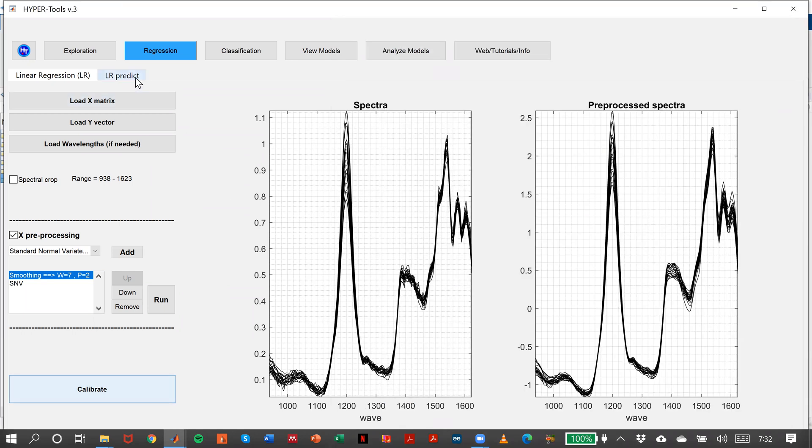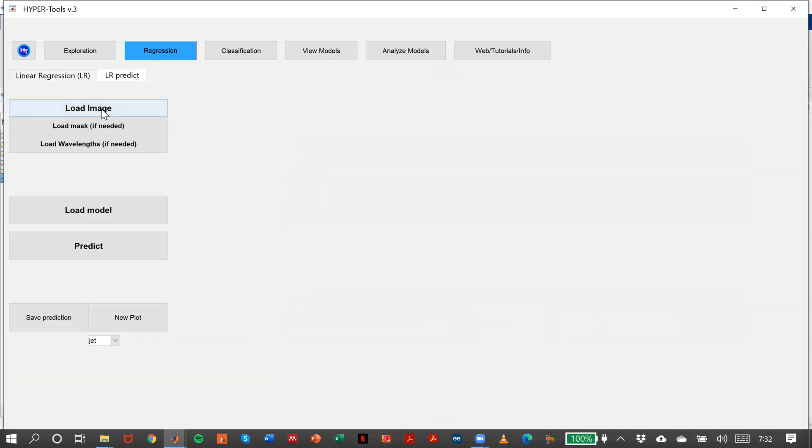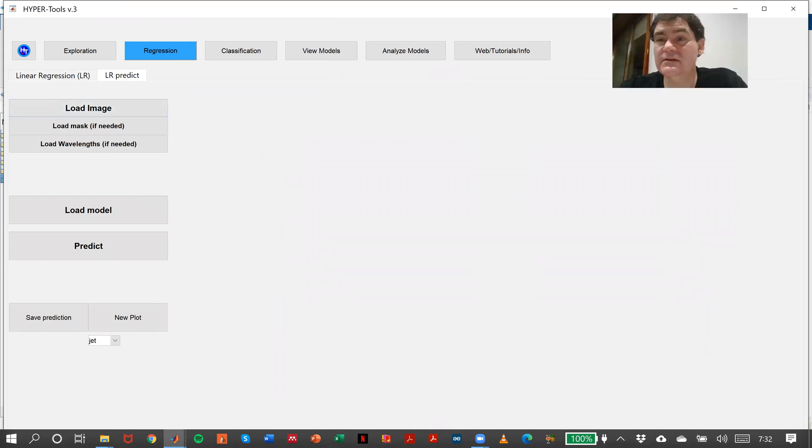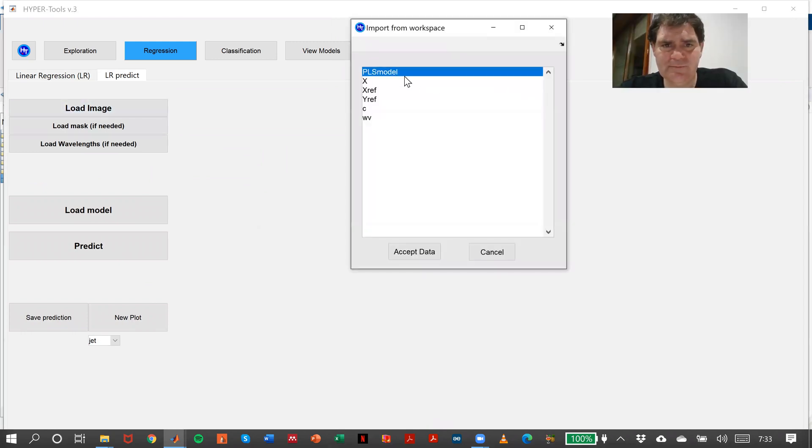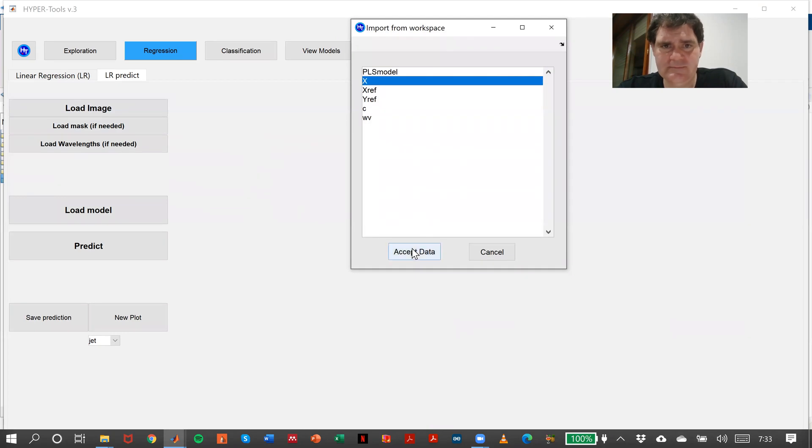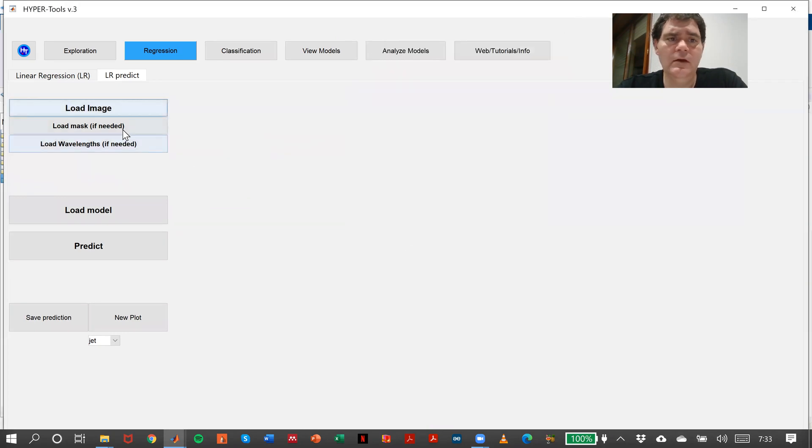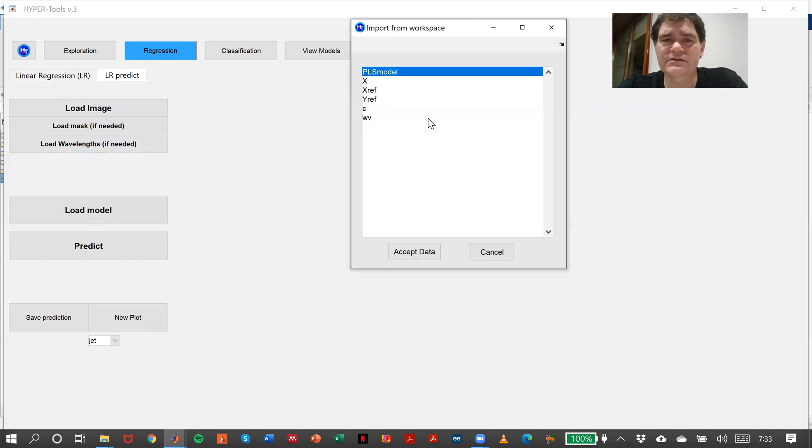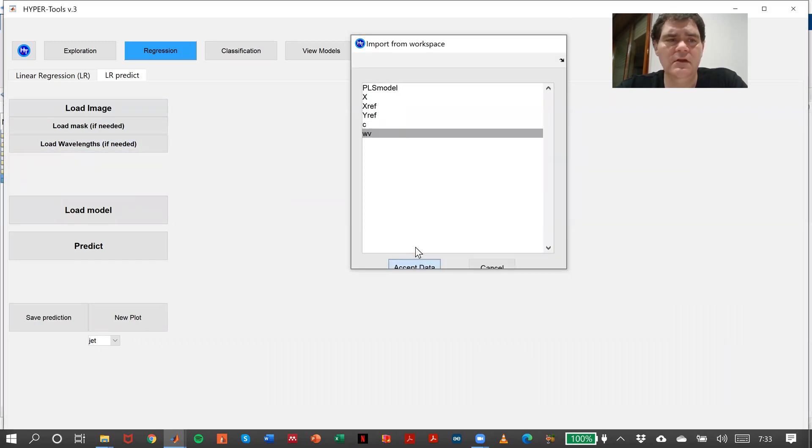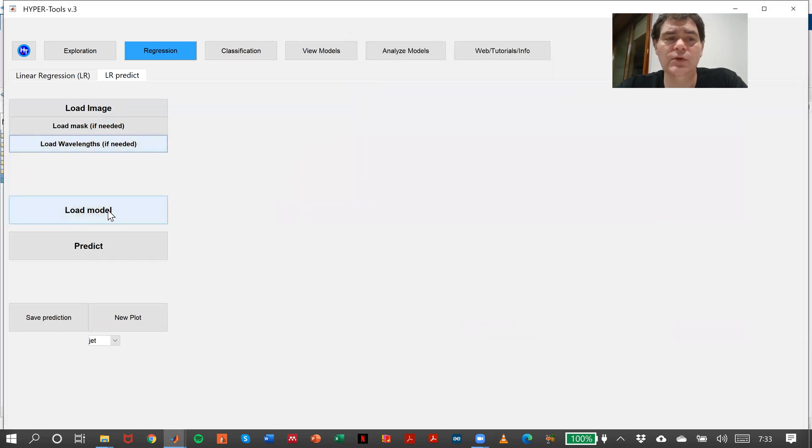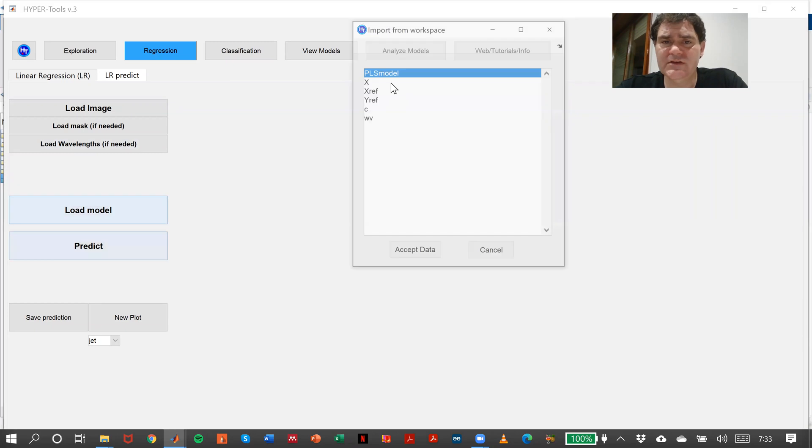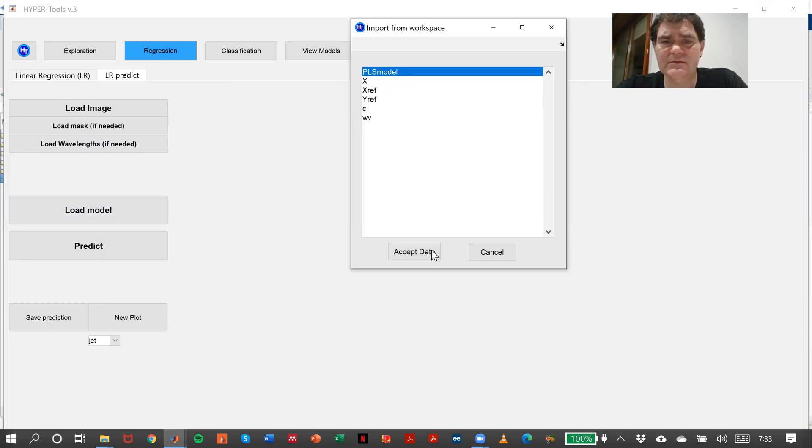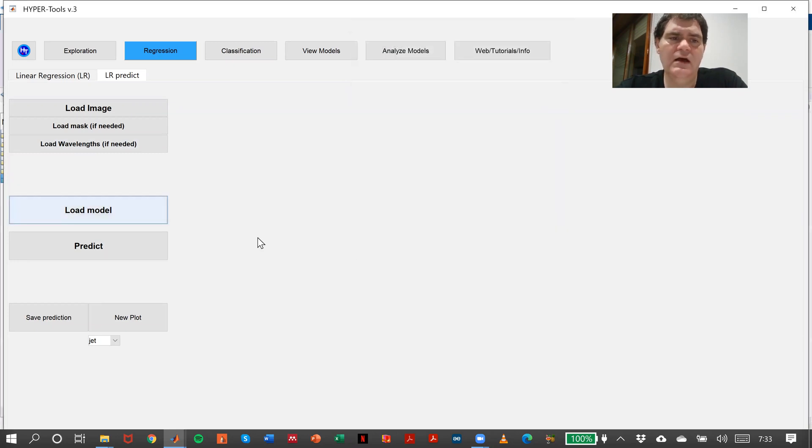In prediction, the only thing we need to do is load the image X, the mask—in this case we don't have a mask—and the wavelengths. We just load the model that we just made, PLS model, and predict.